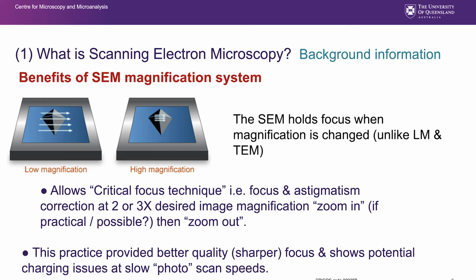Talks there about the critical focus technique, talks about focus and astigmatism correction. So focusing and astigmatism are things we have to understand in terms of an SEM very well, so we'll certainly look into those in detail.